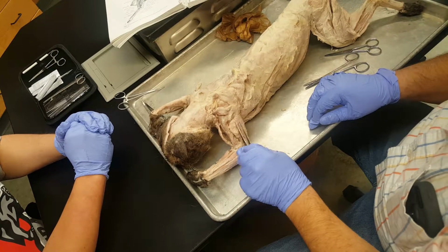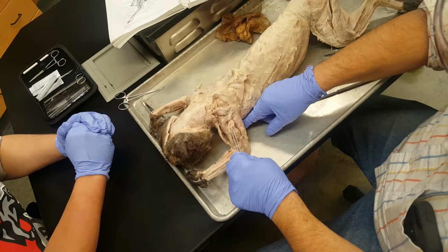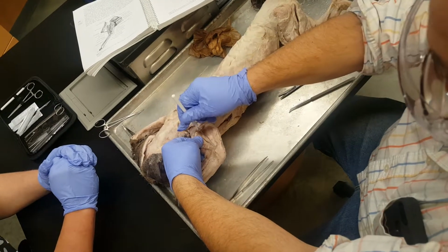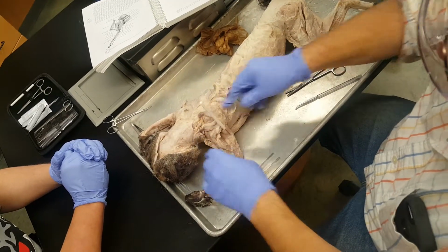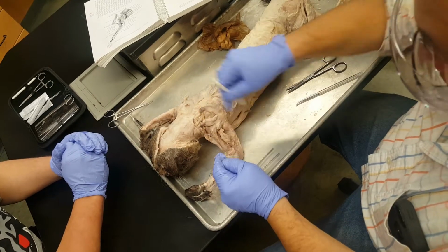I only see two. Well, that's because this is the lateral head of the triceps brachii. This is the long head of the triceps brachii. And way down in there is the medial head of the triceps brachii. So if you come in and the pin's sticking right in there like that, that's the medial head of the triceps brachii. If you come in and stick it right there, that's the long head of the triceps brachii. There, that's the lateral head of the triceps brachii.